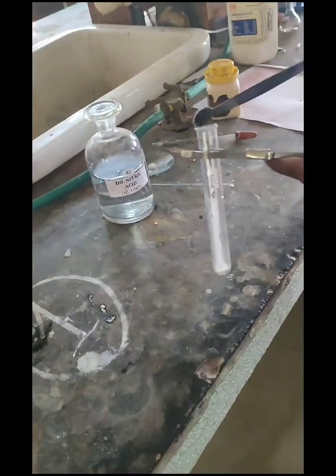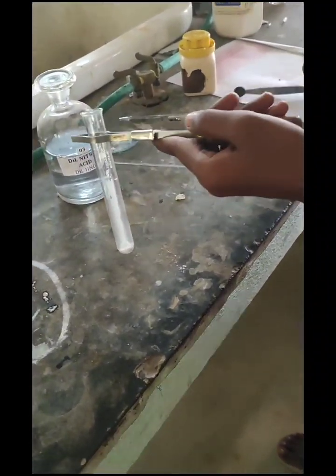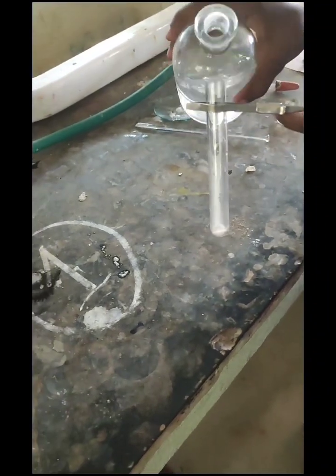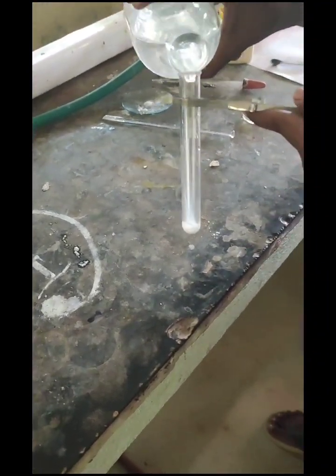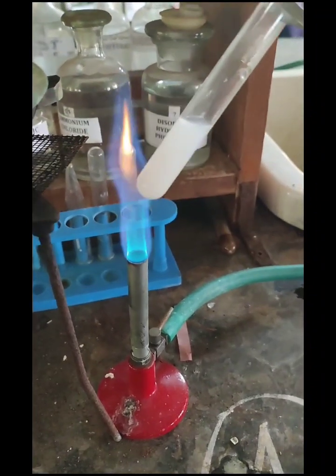For the phosphate test, take around 10-15 mg of substance in a test tube and add 0.5 ml of dilute HNO3. Then boil it for a few minutes.